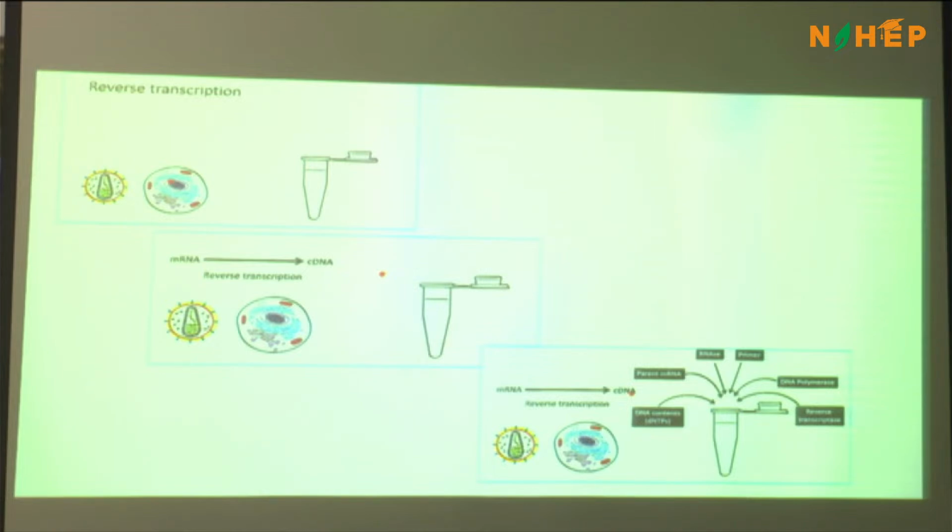I think what you practiced yesterday is cDNA-based qPCR, correct? You use cDNA as a template, not RNA, right? That is a two-step qPCR, isn't it? Can you tell what you did yesterday? Anybody? What you practiced yesterday? What was supplied to you in the form of template? RNA or cDNA? cDNA, okay.